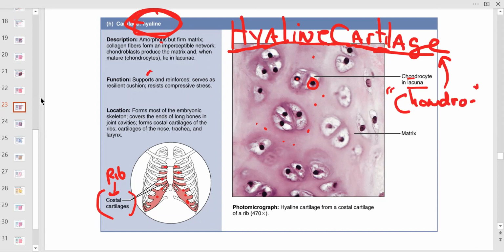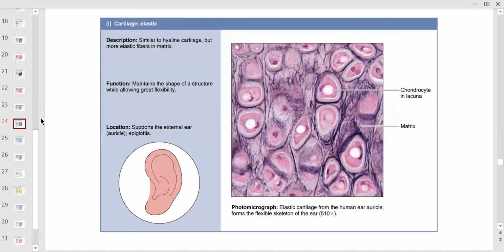So I like this one. I think this one, I'll put stars and I'll make a heart, right? Emoji with a thumb up, whatever. Okay, so that's hyaline cartilage. Did I say hyaline cartilage? Say it all the time.